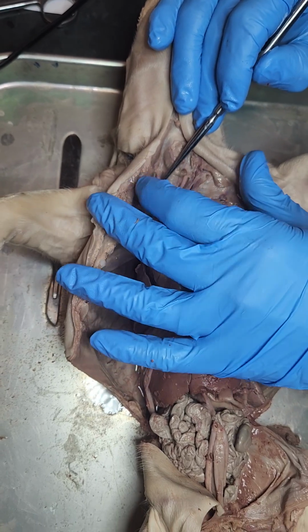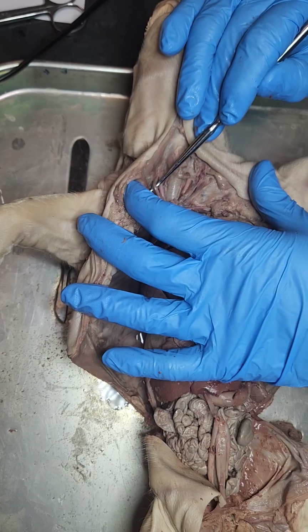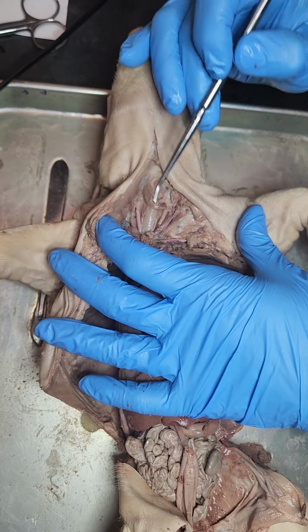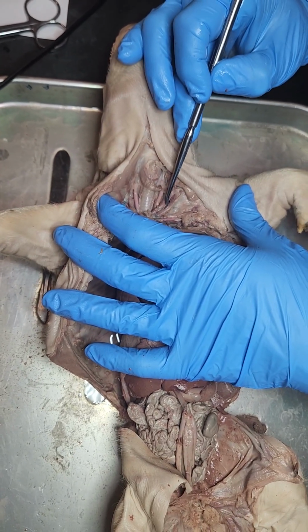The next one's internal jugular vein. So we're just going to step out one, and that's the internal jugular vein. Then when we step out another one, we get the external jugular vein. Now it's ruptured right here, but it's still right here. On the other side, we can see it better. Carotid artery, internal jugular, external jugular.